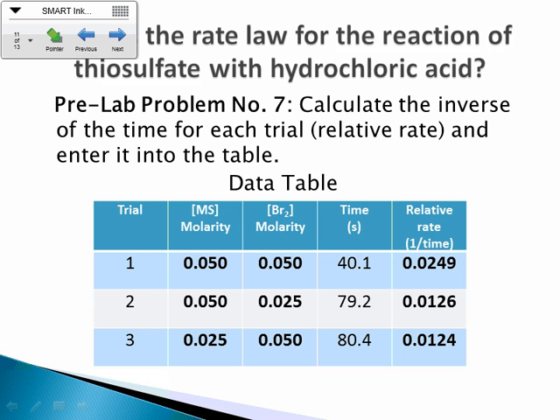So what that means, that's what screwed me up as far as being able to use this for any of those other experiments that I wanted to use it for, because this is not a molarity per second rate here. This is not a typical concentration over time rate. So we can't plug it into any of the formulas and solve for our rate constant or anything like that, which kind of screwed up what I wanted to do with it. But it'll work for our purposes here, okay? So there's your relative rates, right?